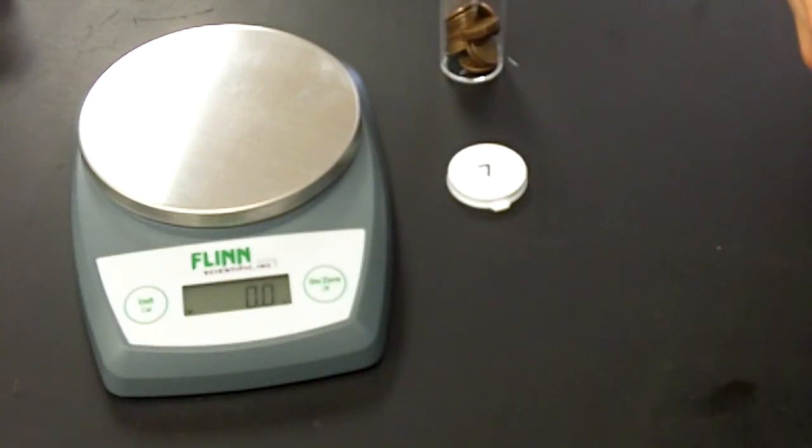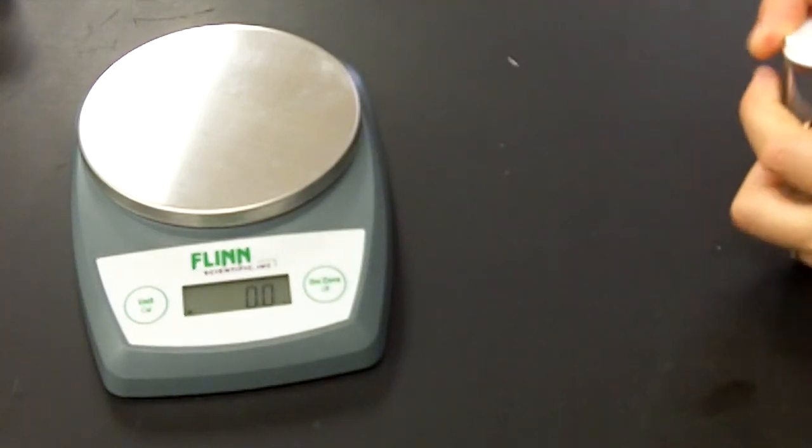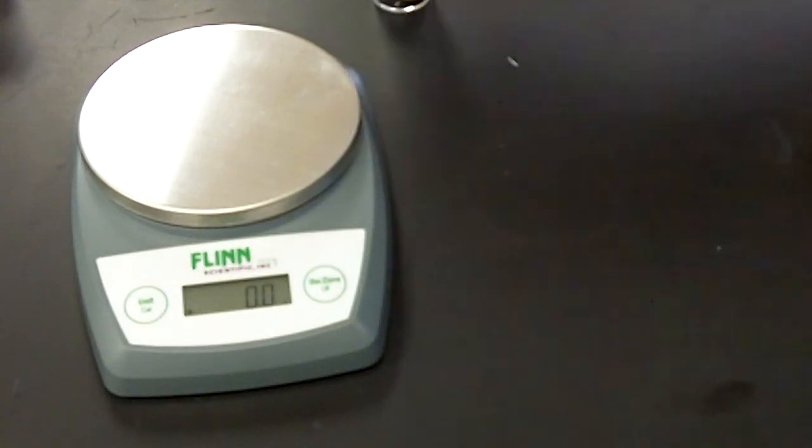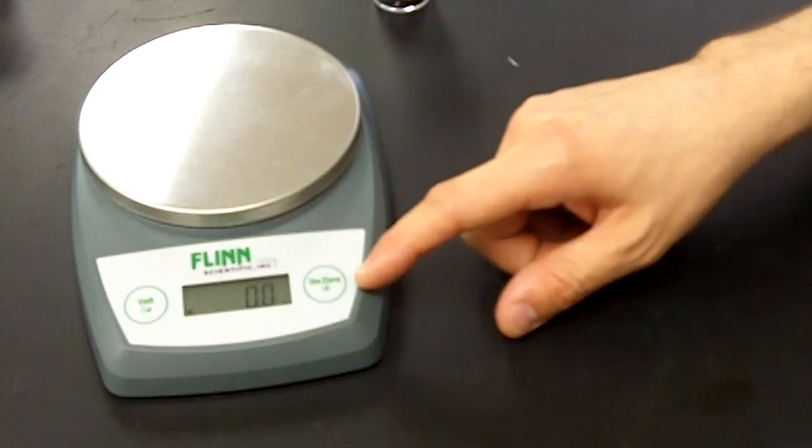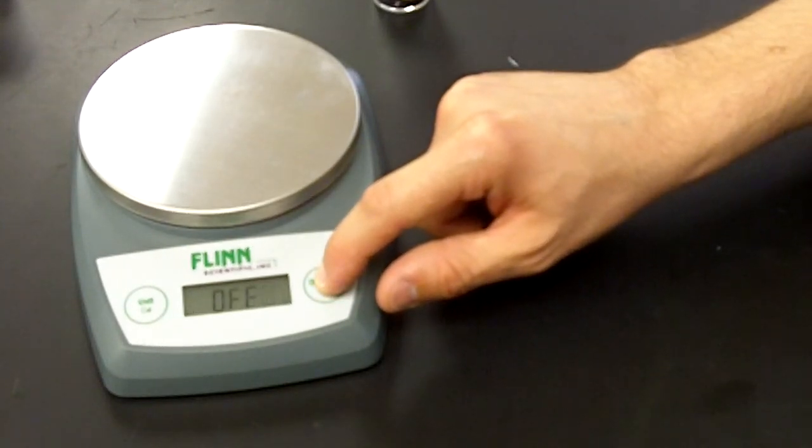Step number five: Replace the pennies into the container. That's been done. Step six: Clean and organize the lab station. Turn off balance. Step seven: Wash hands with soap and water, as I will be sure to do. That concludes the Unit 2 Isotopes of Pentium Lab.